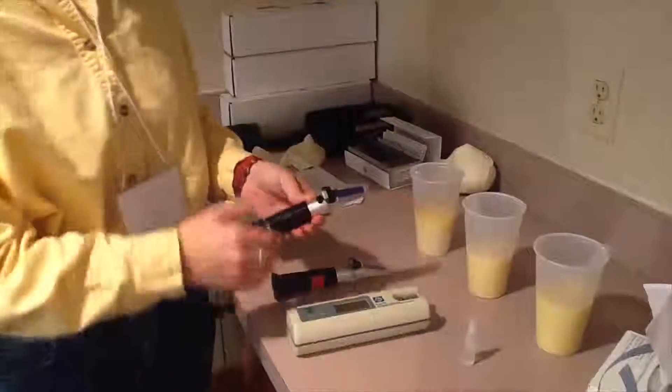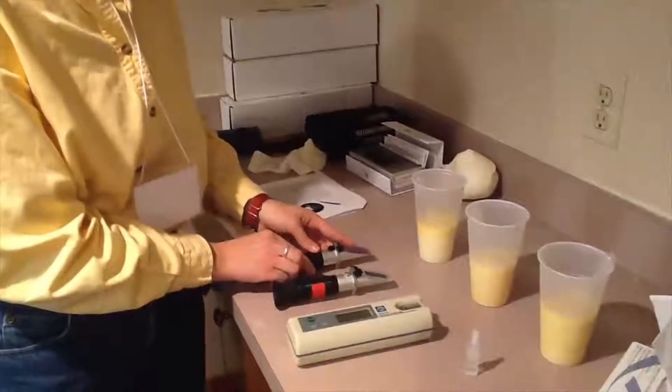Another tool that we are using today is the refractometer. You can have a visual or you can have a digital. Obviously the digital is a little more expensive, but they both will give you the same number. They are based on a BRICS reading, so what they will read is how the colostrum is bending the light, whereas the colostrometer measures density.